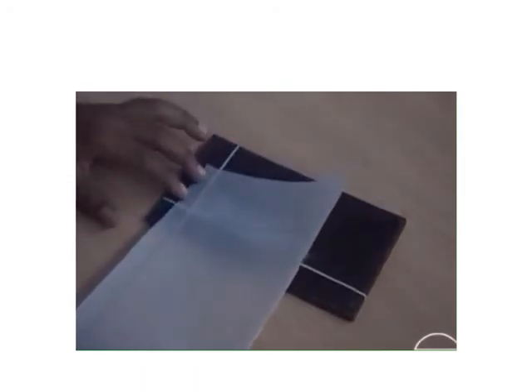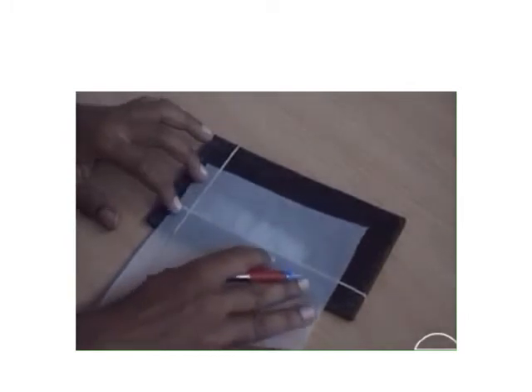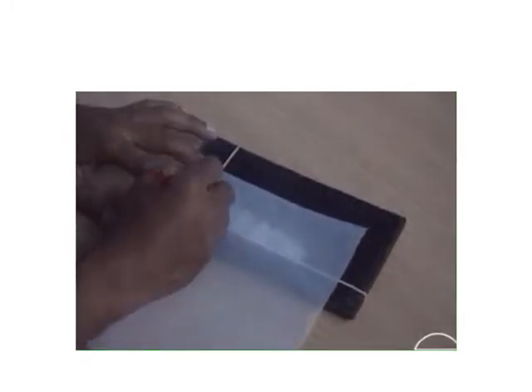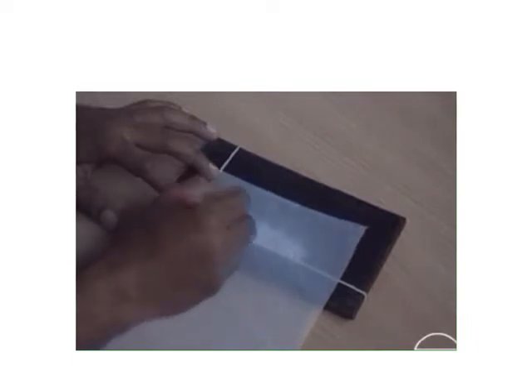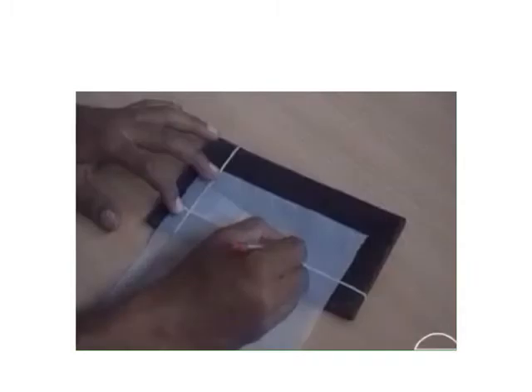Then after transferring all the fibers, a tracing paper is kept and the edges of the fiber are traced. Edges of the fiber ends are traced. We can use a plastic scale. Let us see the tracing once again. You are keeping the paper on that fiber array and tracing. Instead, you can use a plastic scale also and a whiteboard marker and mark the edges and then transfer to paper, which is an easy process. This is how it is traced.